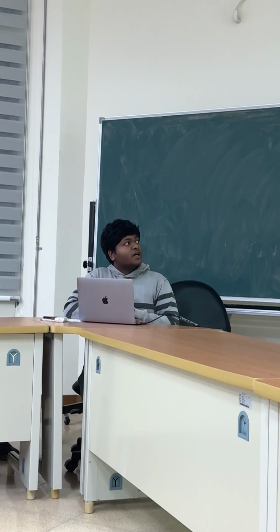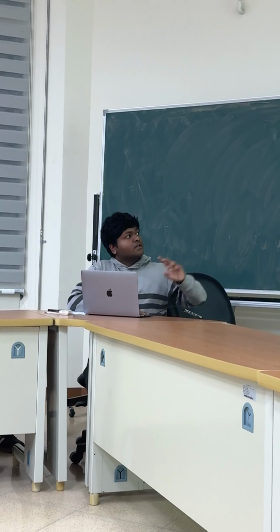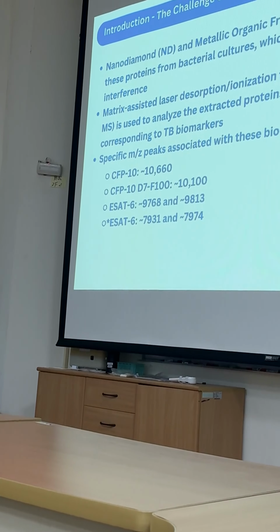The specific peaks we are targeting in this study are CFP10, the target m/z values, and ESAT6. These are 1, 2, 3, 4. There are a total of 6 peaks which we are targeting.